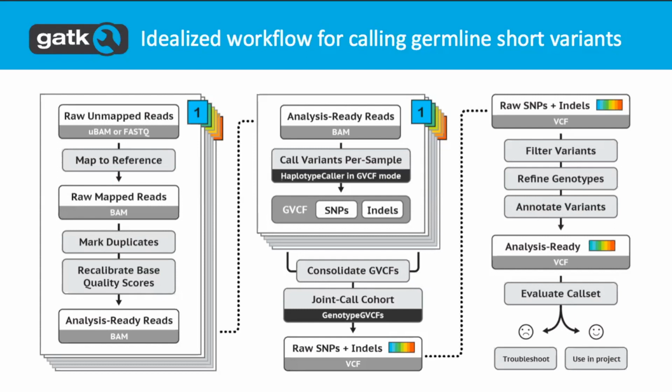Regarding the joint calling, in a typical big project, there's also going to be maybe a few thousand samples first, and during the evaluation, I think that protocols and sequencing machines may be changing. But if you were to just go with the GVCF approach, like you create one GVCF file from one sample, is there some kind of limitation of adding the files that were not sequenced in a similar way as the ones in the main? So are we running into danger of mixing together in the end?